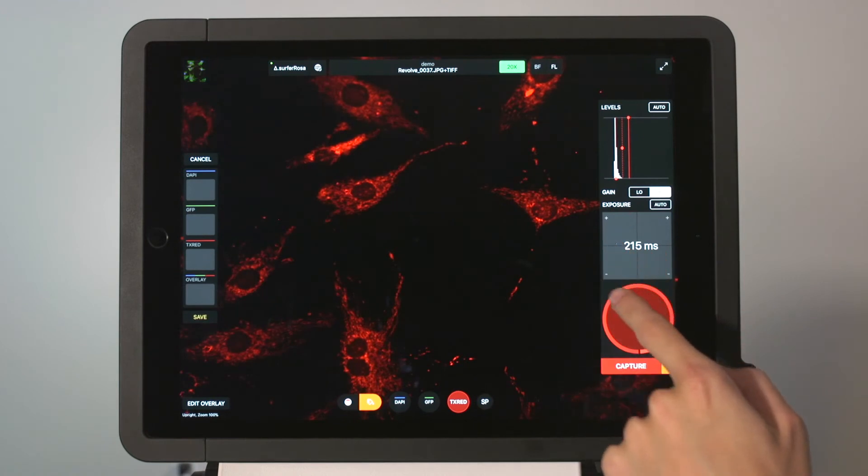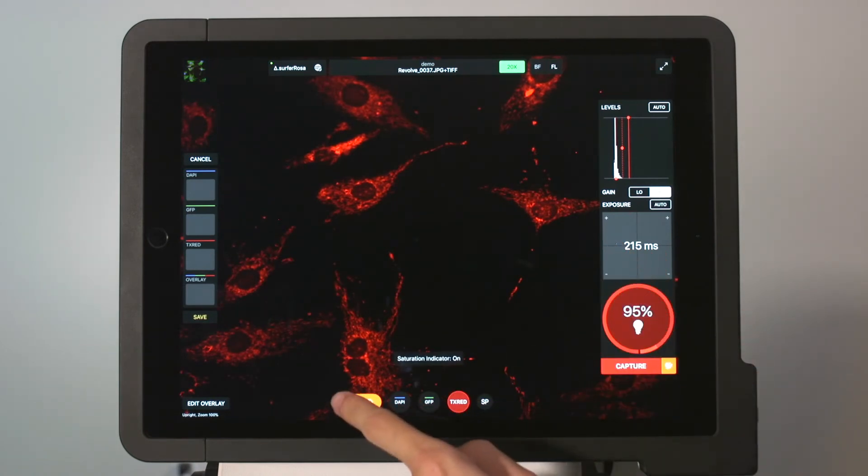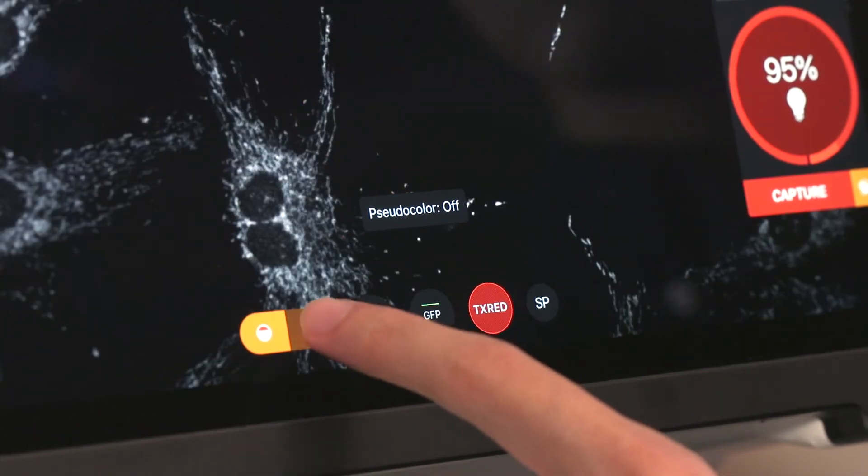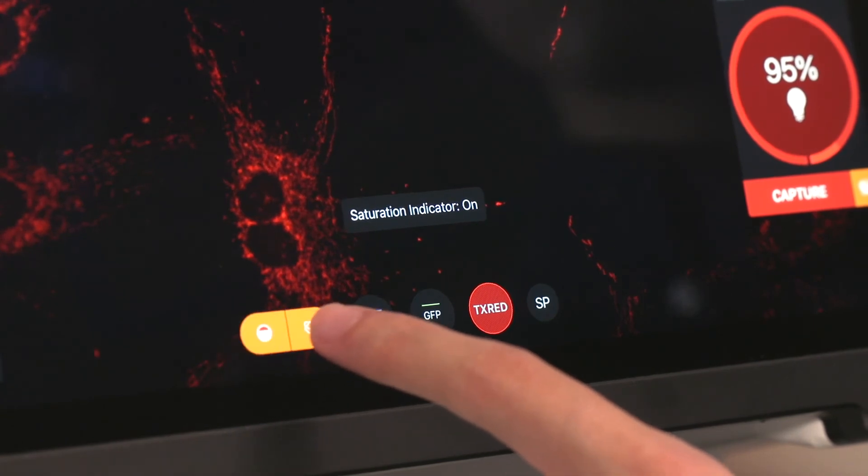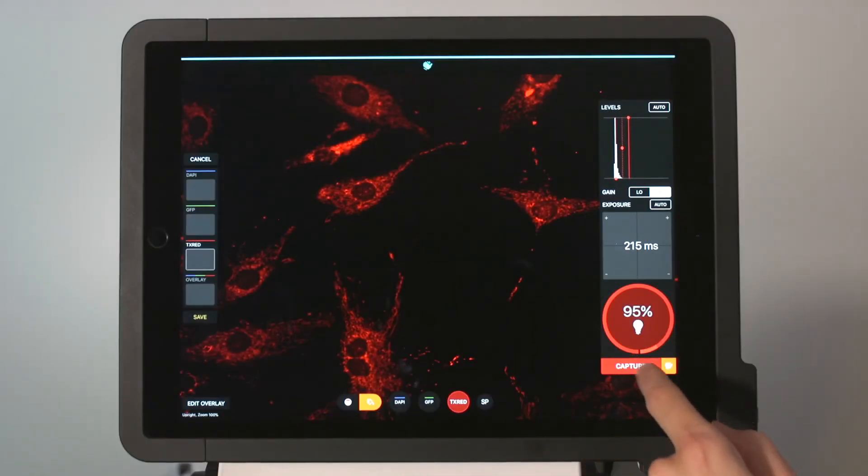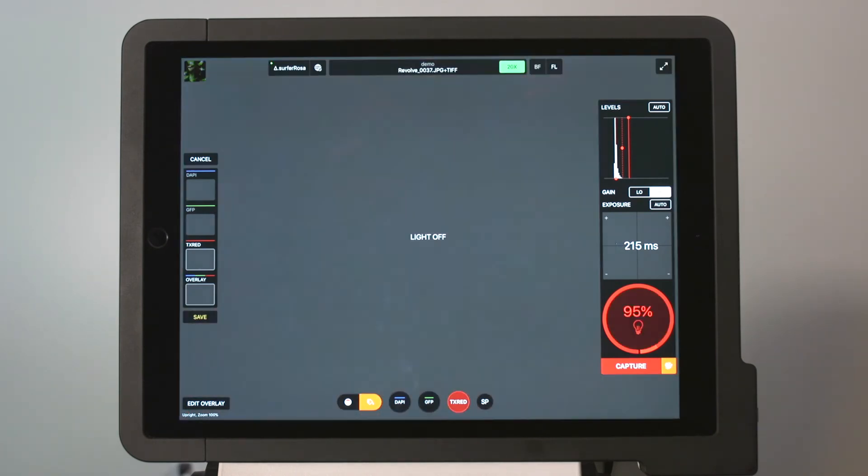On the bottom, we can toggle our saturation indicator and pseudocolor on and off. Now, we'll capture this image using a monochrome 3.2 megapixel scientific CMOS camera, and begin creating our overlay.